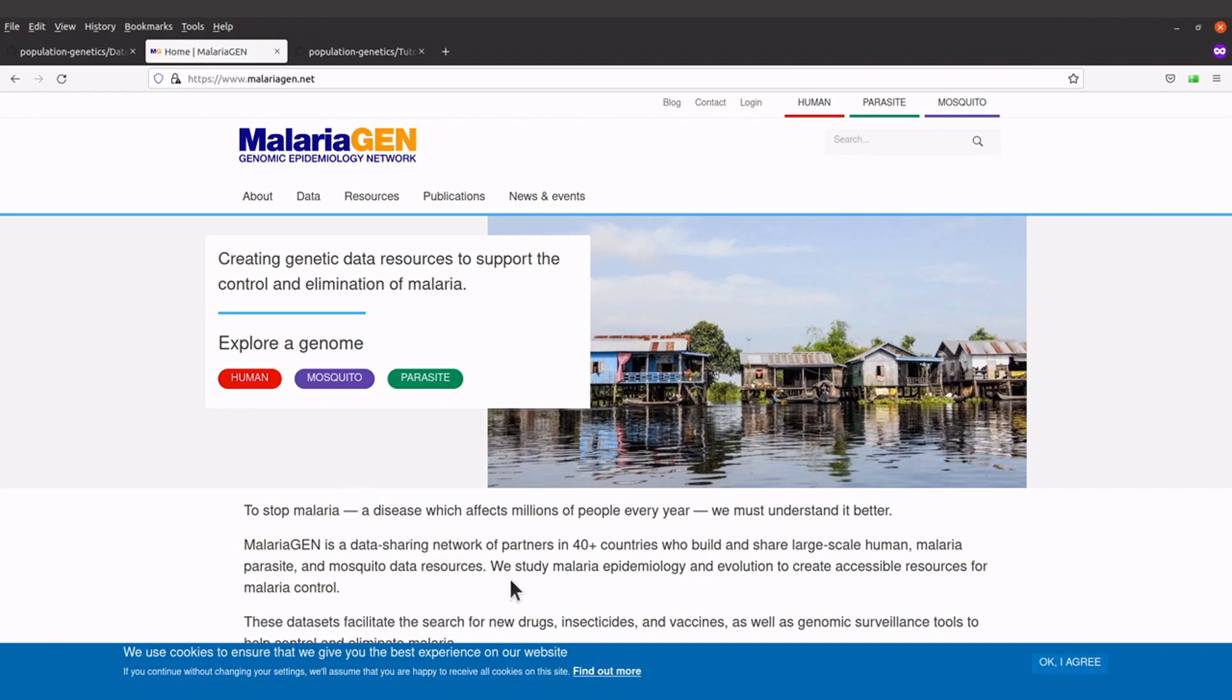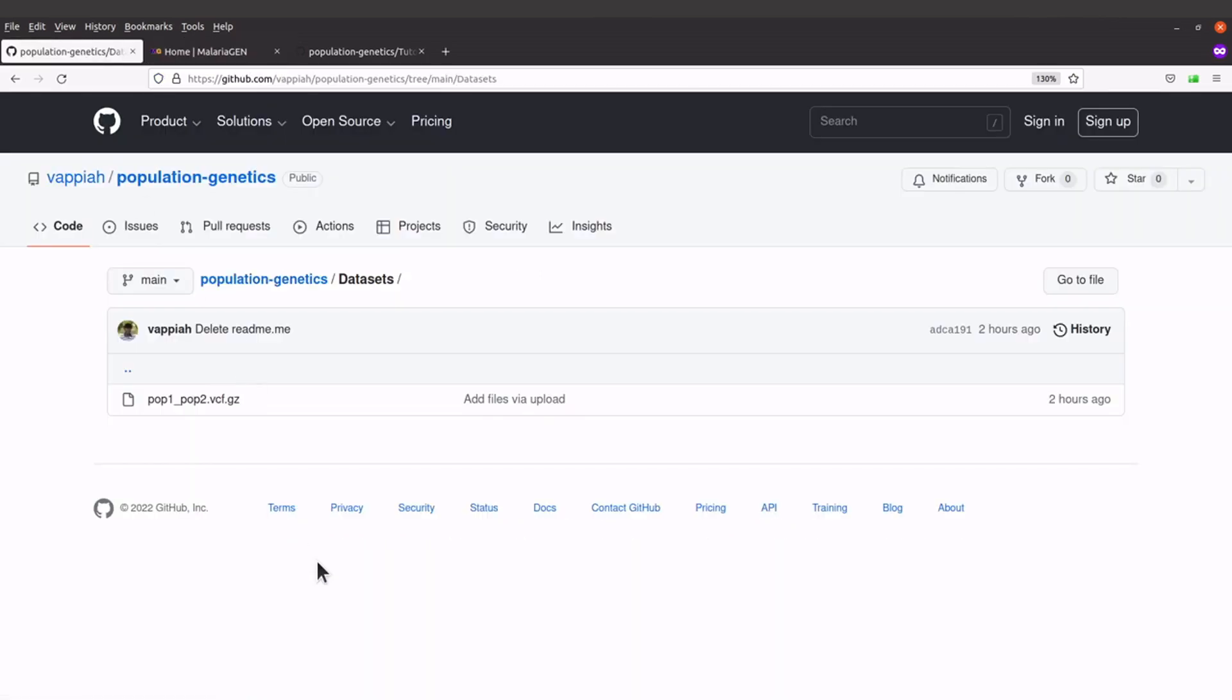So I took the original VCF file and then I downsampled it and also filtered so that I finally had high quality variants and that is what I'm going to use. Okay, so the data here is made up of variants for 60 Plasmodium falciparum isolates. So these isolates were taken from two different countries. In other words, we have two populations here. One population is from the Gambia and then the other one is from Bangladesh. So these are the two populations.